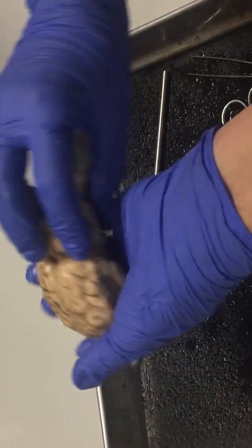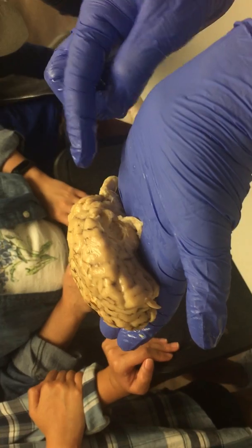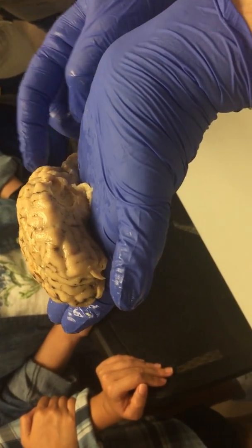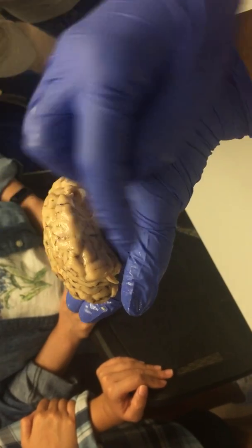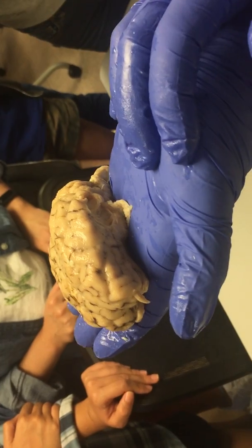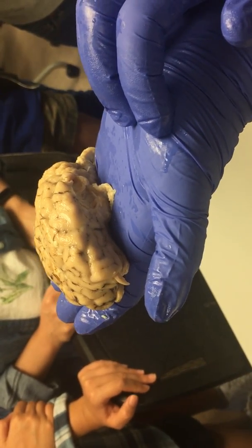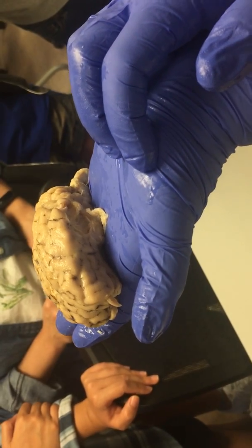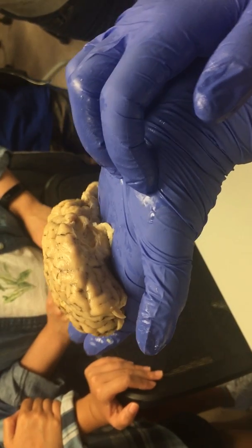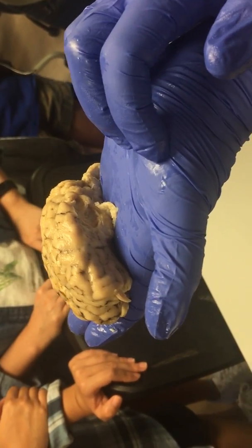What we do know is there's our cerebellum and there's our cerebrum. Notice that the cerebellum on a sheep is really large in comparison to the cerebrum. Why would that be? What does the cerebellum do? Balancing — and it corrects movements. Smooth muscle movements, right?